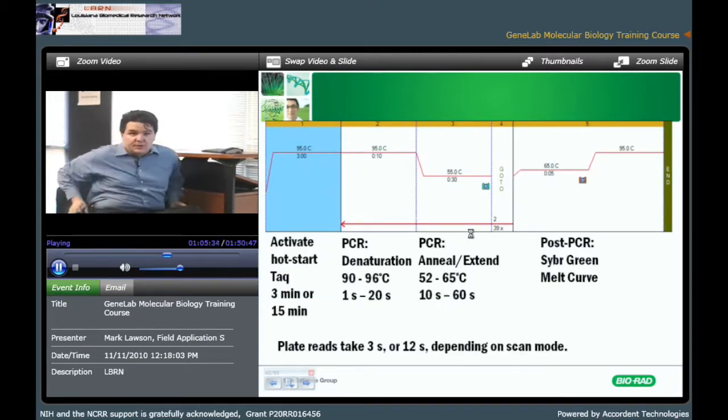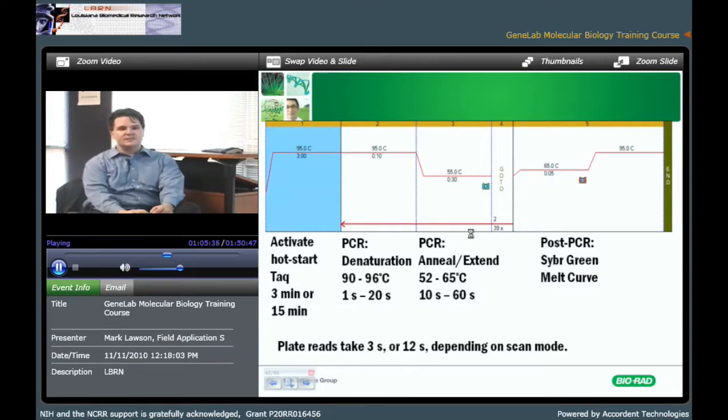Some of you might still be using old-fashioned conventional PCR protocols for your real-time, simply because you went straight from a conventional protocol to the same protocol on a real-time instrument. You might also be using very old hardware that required a long time to equilibrate. Newer instruments require much shorter reaction conditions. And besides saving you time, it can actually improve the quality of your data.